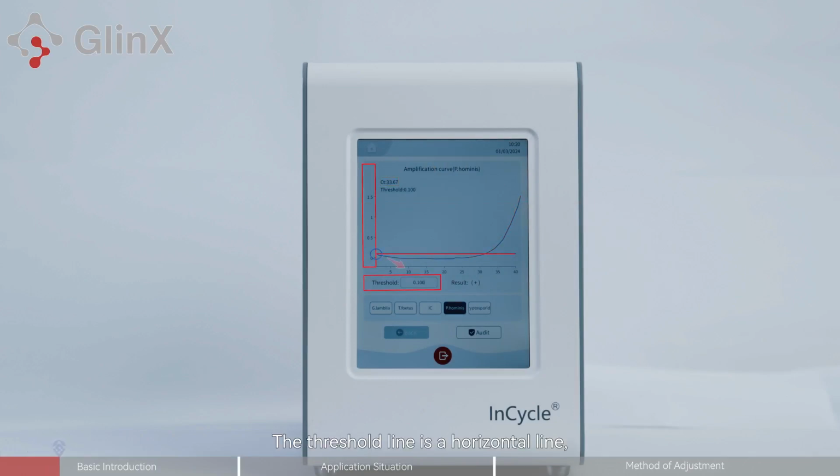The threshold line is a horizontal line, and its value on the ordinate is the threshold. This is the amplification curve, which reflects the change of real-time fluorescence signal intensity generated by the instrument through real-time detection and acquisition of fluorescence signal. The CT value represents the number of cycles that the PCR tube undergoes to reach the set threshold. That is, the abscissa value corresponding to the intersection of the amplification curve and the threshold line.